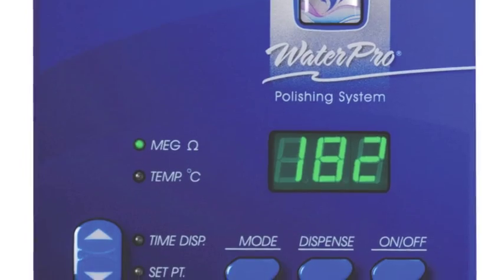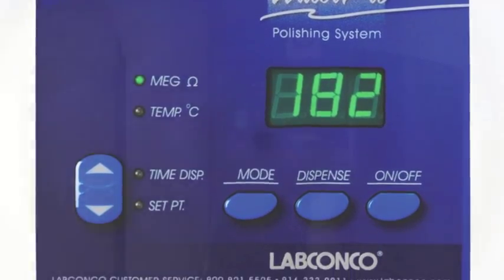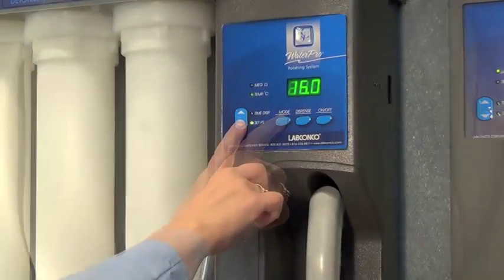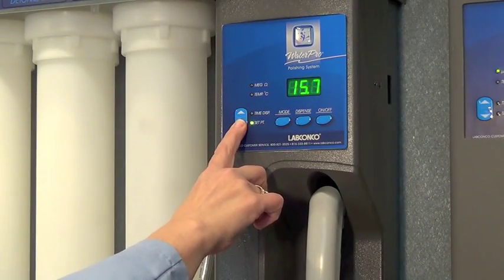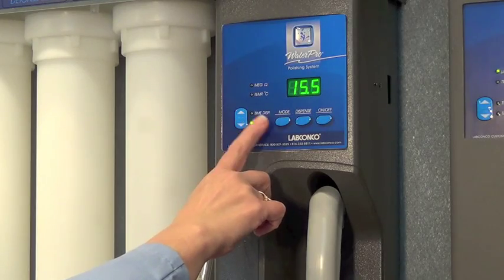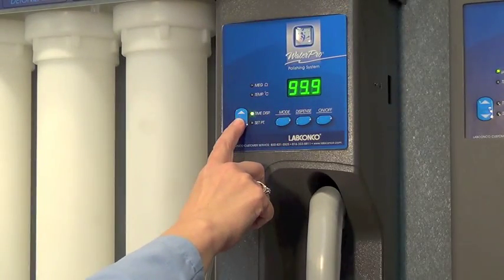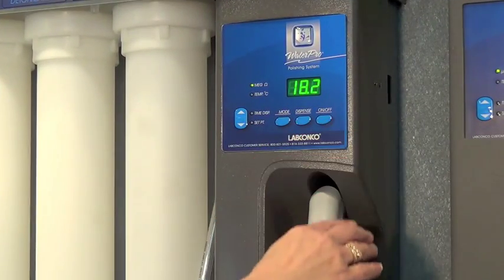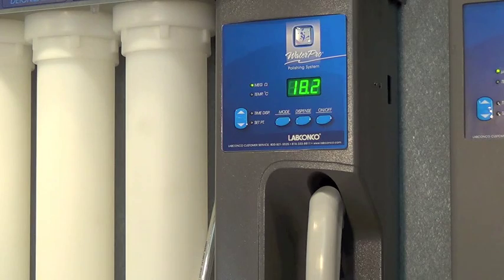The WaterPro system's LED control board displays water quality, water temperature, and minimum resistance set point. The control board also features a programmable time dispense mode. The on-off switch starts the recirculation and lights the display.